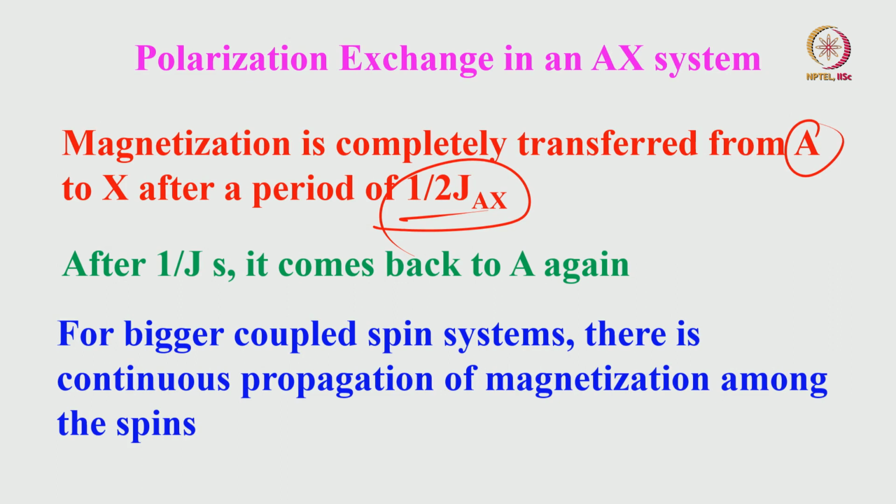Okay, one will give to the other one, next it will give to the next one, like that. And you can understand the propagation of magnetization pictorially like this. Let us say this is tau m, I am calling it the mixing time. I keep changing the mixing time. I keep on increasing the mixing time from some minimum value to maximum value as I go down.